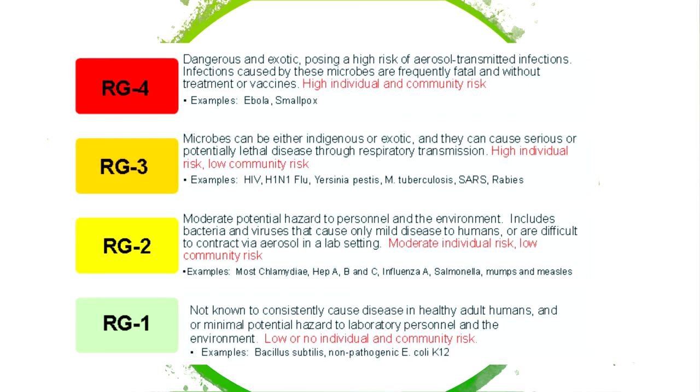So, para hindi ka ma-prick, tinuturuan ka kung paano ba yung proper way of handling sharps. Paano ba ang proper way of extracting blood, 'di ba? So, if you do not follow the procedure, definitely magkakasakit ka. Okay? So, sabi dito, moderate potential hazard to person and the environment includes bacteria, viruses that cause only mild disease to humans and are difficult to contract via aerosol in the lab setting. So, usually, ito yung mga makukuha mo through ingestion kapag kinain mo, 'di ba? Or direct contact ka talaga. And parenteral spread.